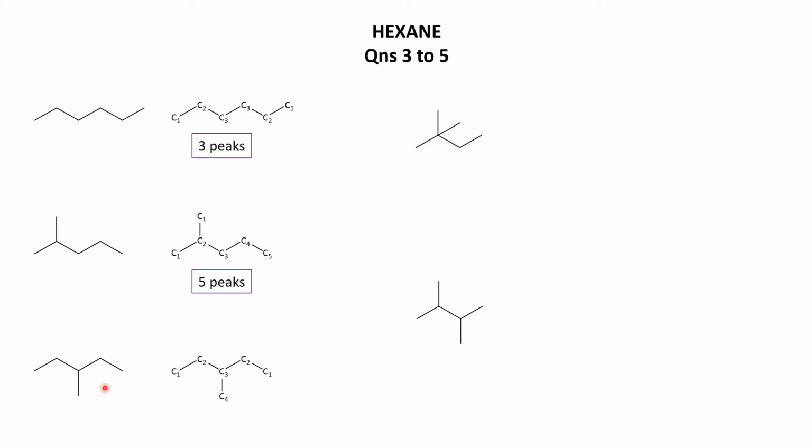Hopefully you can start to see when carbons are going to be equivalent. One easy little thing is start counting from one end and then try from the other end. And if they're indistinguishable counting-wise, then they're probably indistinguishable chemically-wise.